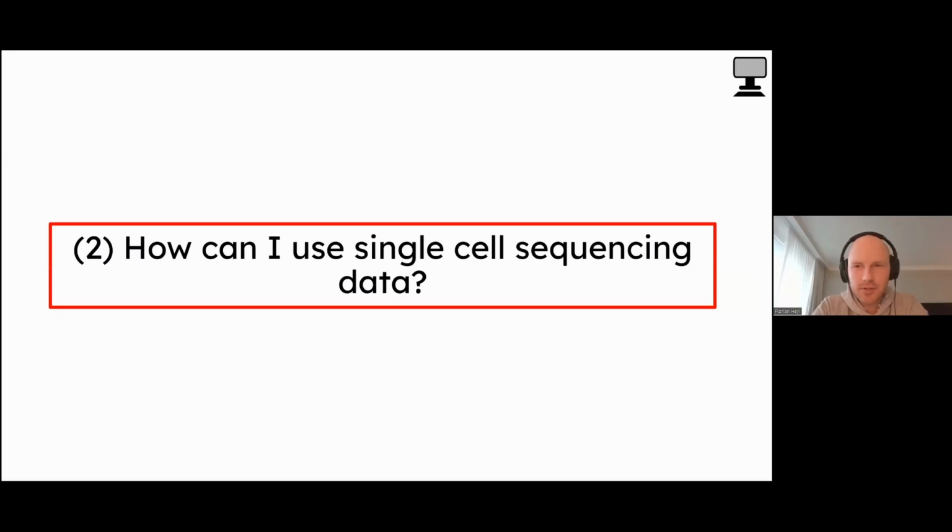Then we come to the bioinformatics, and there I want to give you, first of all, an overview, so a path, what is commonly done for single-cell RNA-seq data, and quite often for other single-cell types. But if you do something else, then you might do additional steps or different steps.